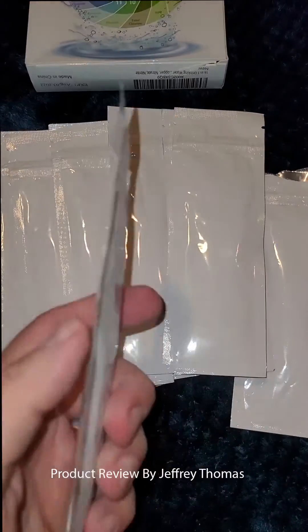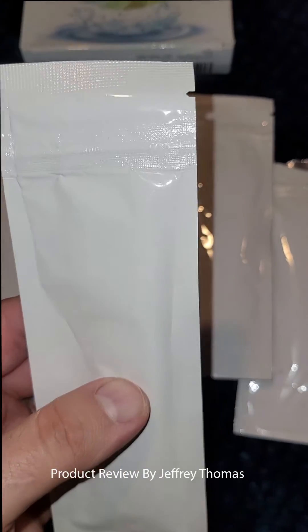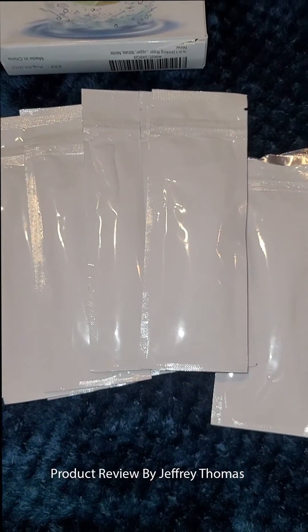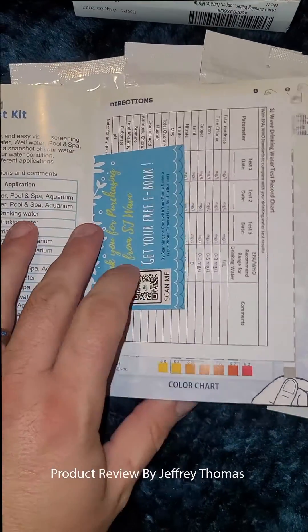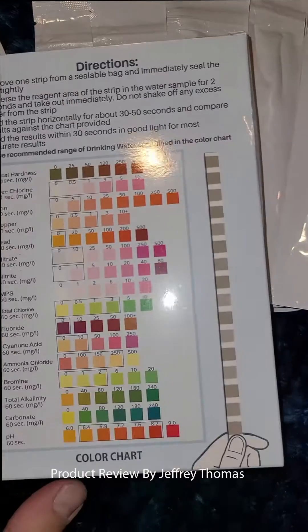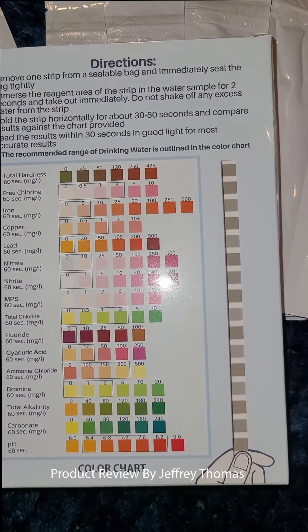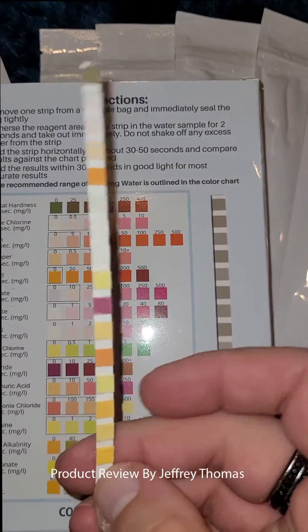Heat and humidity won't affect them because there are about 10 strips in each packet, keeping them safe for long-term storage. It comes with an information guide, but the most important thing is on the back of the box — it gives you the coloration chart for the strips and tells you the range they're in. This is the actual strip here.